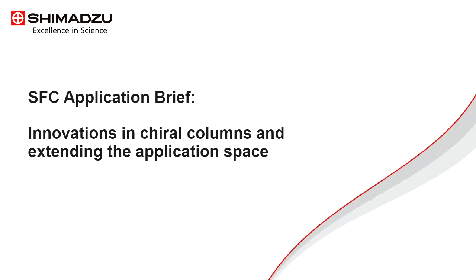And despite the fact that we've mentioned before that chiral applications are not the only applications for SFC, we would certainly be remiss in ignoring the fact that that is one of the excellent spaces to use SFC. So let's quickly look at some innovations related to chiral columns and how the application space is being adapted.